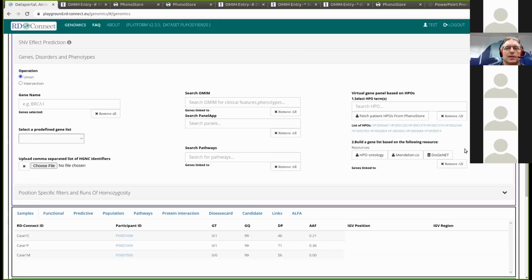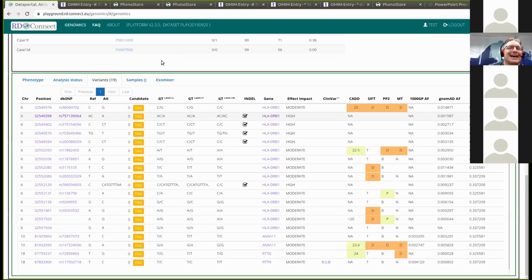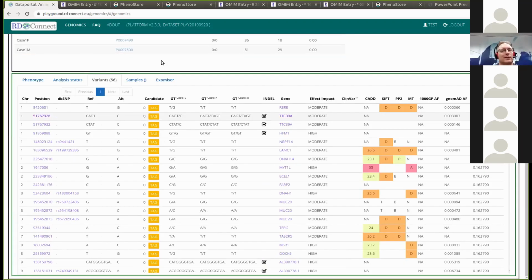I have to clear the HPO gene list. Okay. Steve, also select and deselect the ref alt because the allele frequency has not changed. Just a bit. Perfect. Thanks. Thank you, Leslie. As you can see, Leslie is really our expert in-house user. And well, let's run the query.